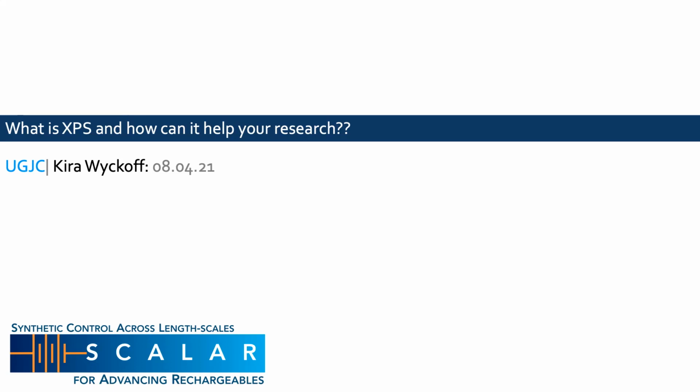So I'm just going to start. Feel free to stop me whenever if you have questions, because we don't really have to wait till the end. I think this is a little more informal. So what is XPS? Maybe this doesn't totally apply to all the undergrads, but start thinking about how it can help your research or answer questions that you might have.